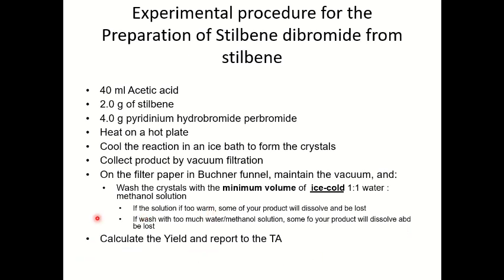Then you need to calculate the yield and report to the TA.